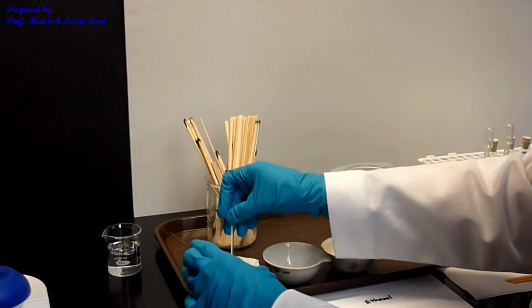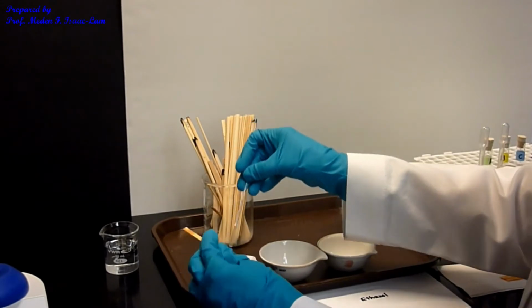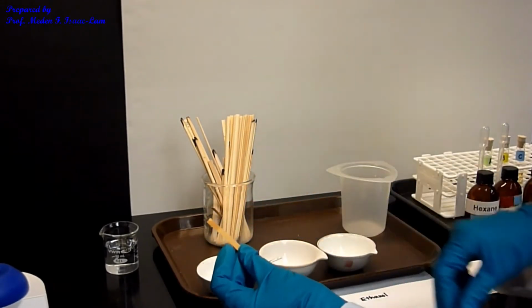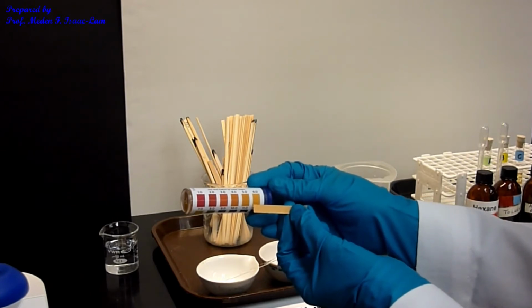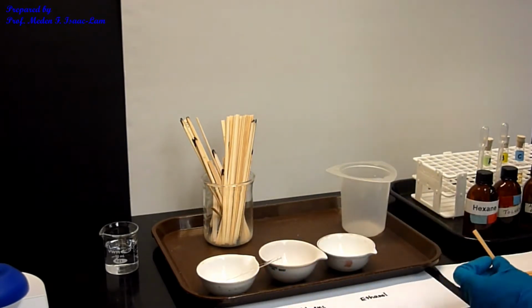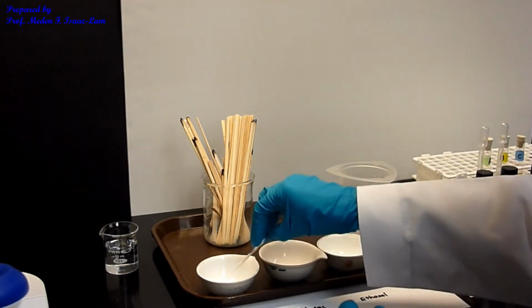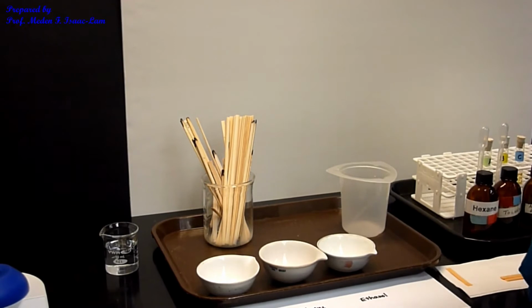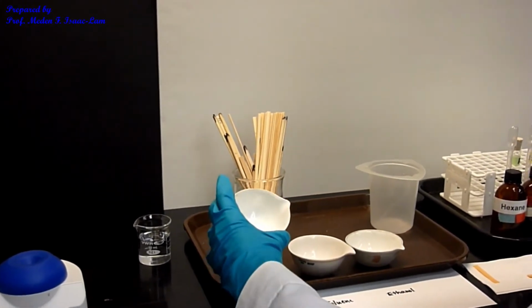Okay. So this evaporates fast. So the color is yellow-orange. Okay. So that was hexane. All right. Oh no, I still have a sample in here.